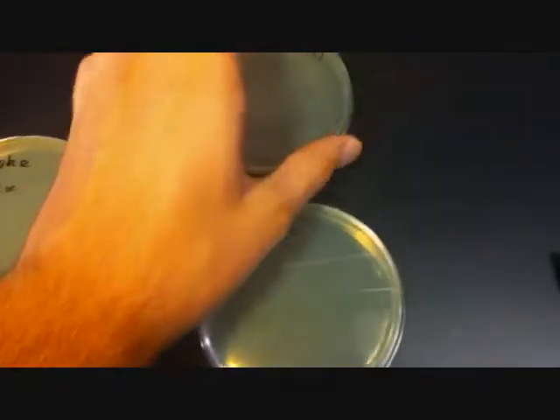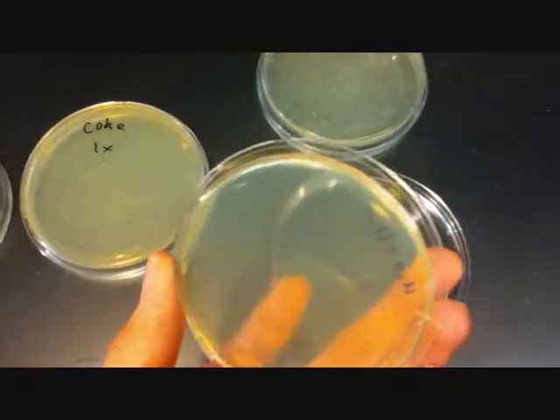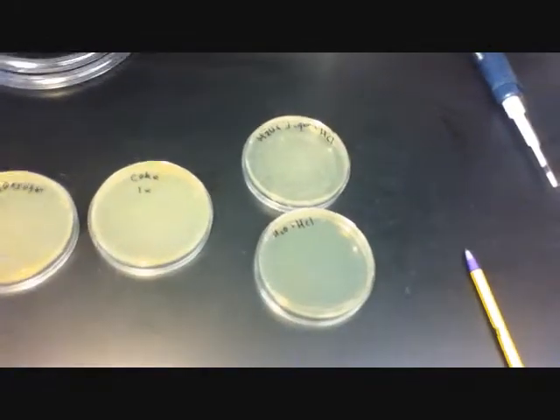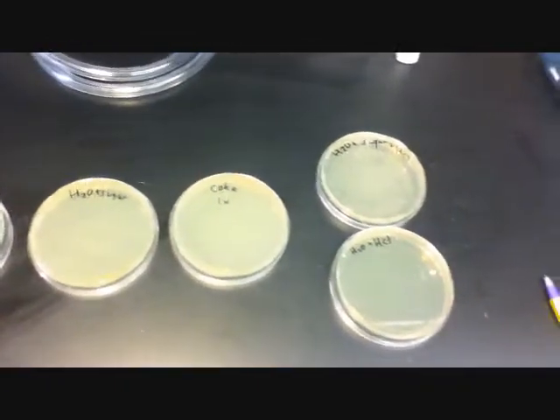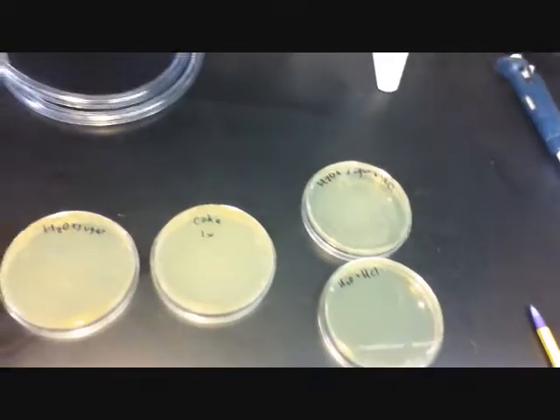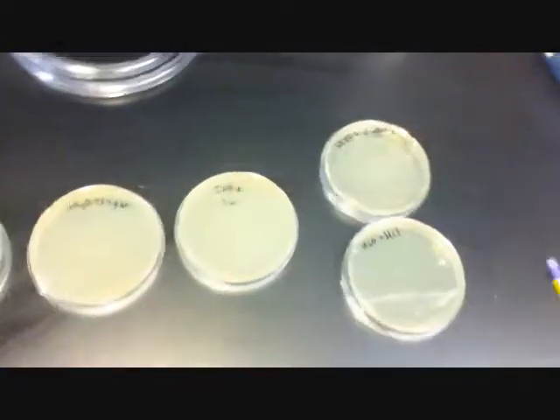In this case, the sugar didn't make a difference. Both of these were dead — there was no way the bacteria could survive. Listeria can only survive at a 5.6 pH minimum, and these were at pH 1 because there was a whole lot of HCl in there. They're gone.